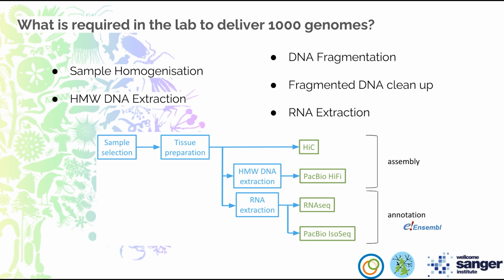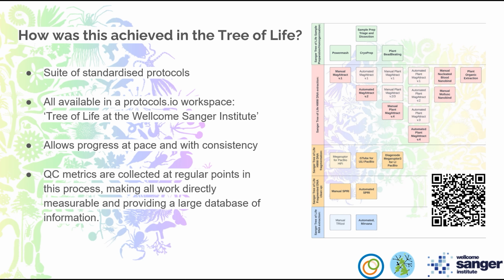So how do we do this in the Tree of Life? Well, we've developed a suite of standardized protocols, which is developing and evolving all of the time. We tried to be as open access as we possibly can, so all of these protocols here are published on protocols.io, and the QR code will take you there.